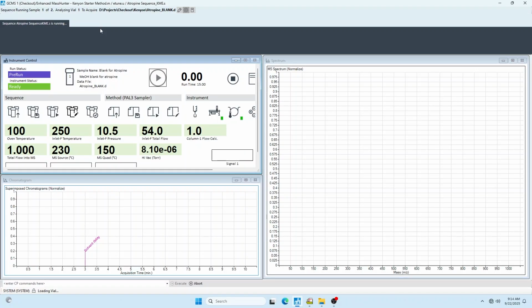If it's a real error in a pop-up, then please do notify me or one of the mentors. But most of the pop-ups that are routine are just going to be, I'm doing this thing, do you want to destroy everything and override stuff? And the answer to that is no, I don't. So just don't push anything and let it continue about its business.